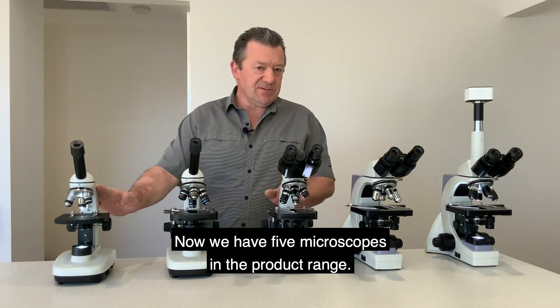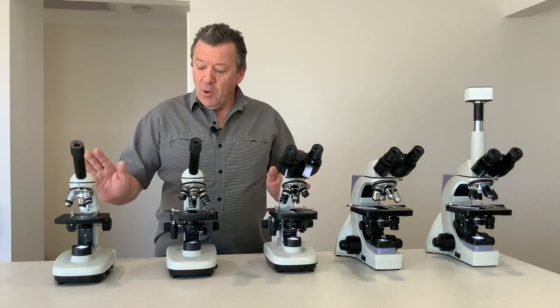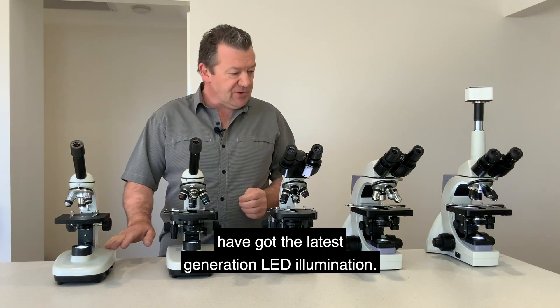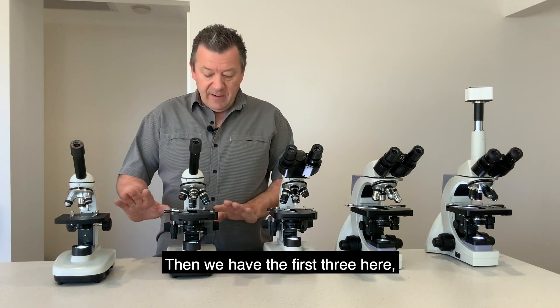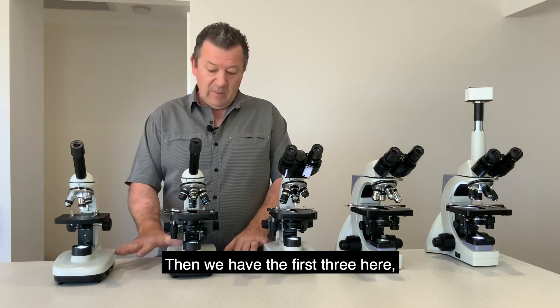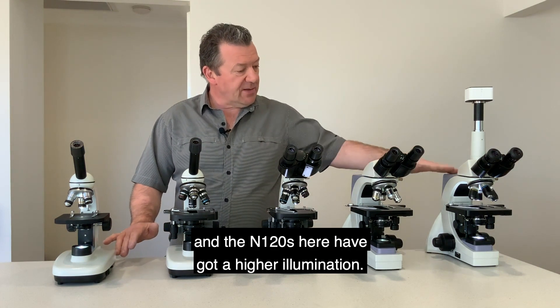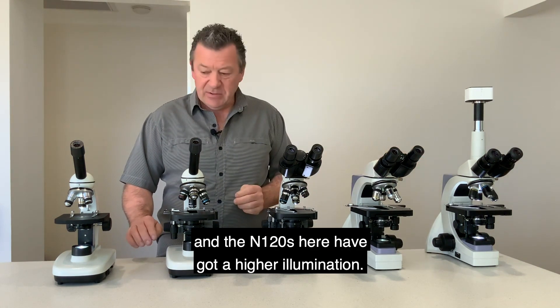We have five microscopes in the product range. All of these microscopes have the latest generation LED illumination. The first three have a lower powered LED and the N120s have a higher illumination.